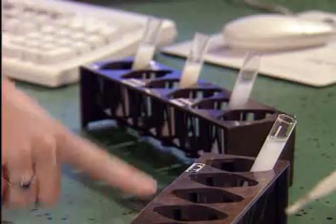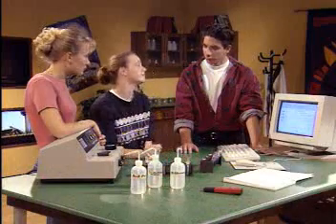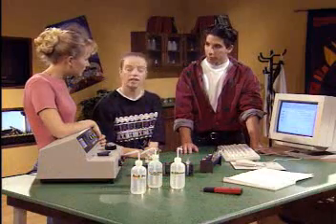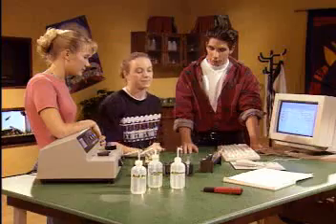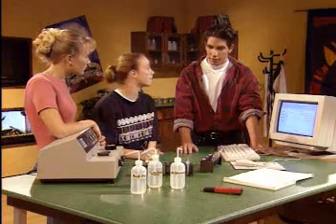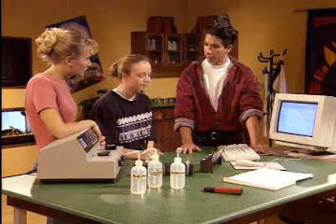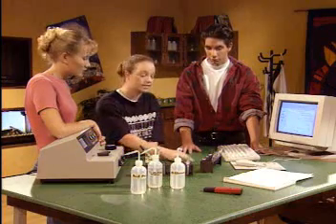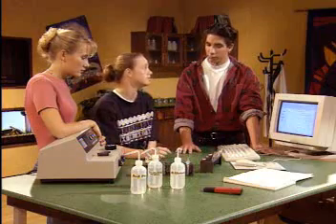One was in the cold, one had more food, and one was in an acidic environment with a pH of 3. What about a control? Well, I grew some more yeast in another test tube with 1 milliliter glucose solution and a pH of 7. So, you set up all the test tubes the same, except for the variables you were testing. That's right. And then I filled them up with distilled water. I put the cold one in the fridge and kept the others at room temperature.